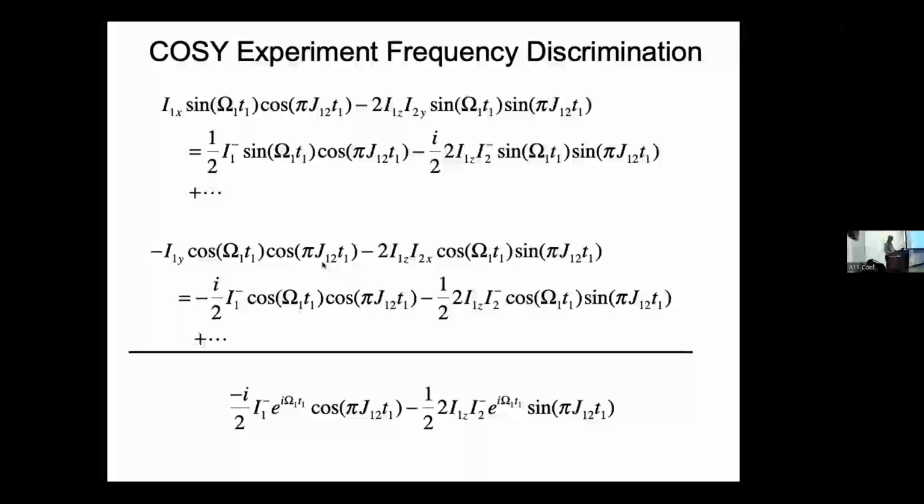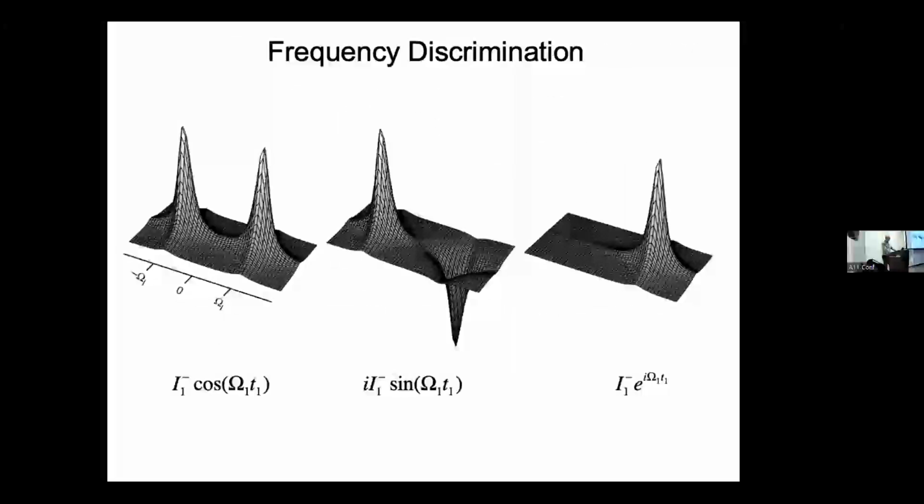and I can add them up in such a way to generate only a single frequency that cancels out the image frequency that came from having only one component. So that's shown here pictorially.